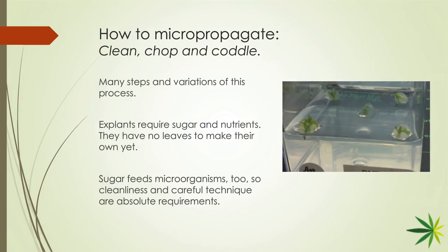You take those freshly cut tips, and before they can dry out and get stressed, you quickly encapsulate them by coating them with alginate, dropping them into a solution that treats them very gently, but gives the calcium that's needed for that little setup. It's basically a cradle or a womb for the growing tip to survive. I was about to use that analogy, like a womb for it, basically. Exactly.